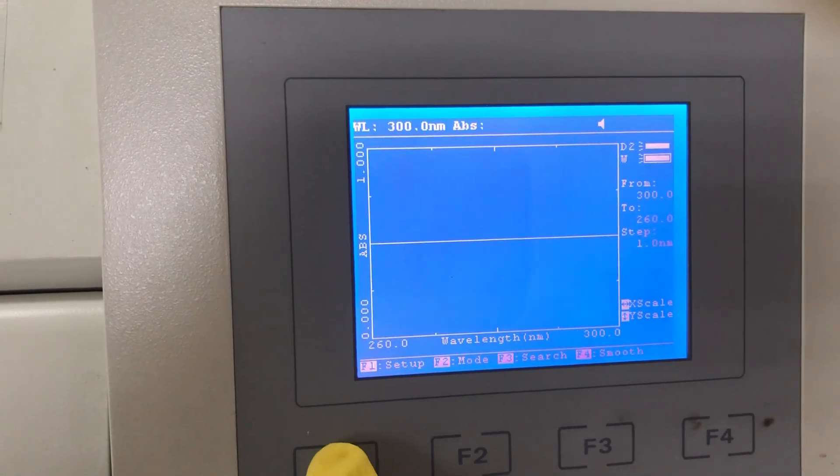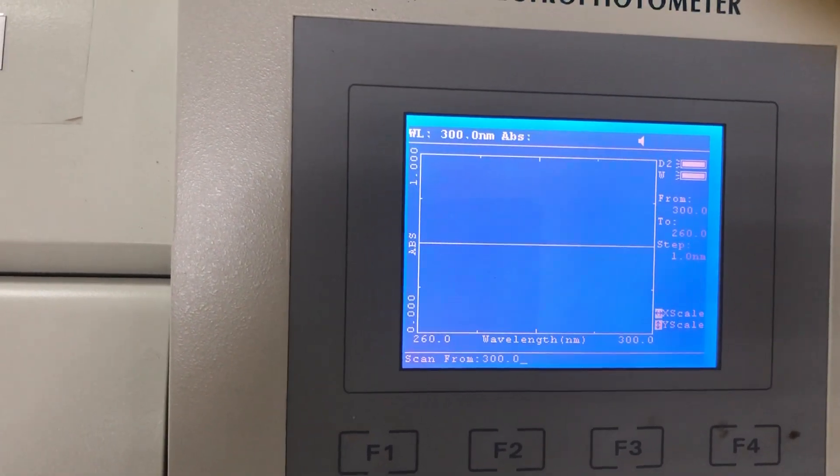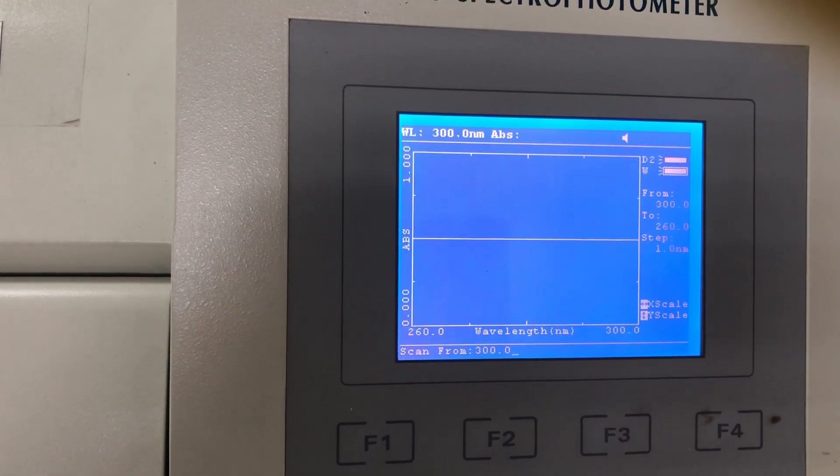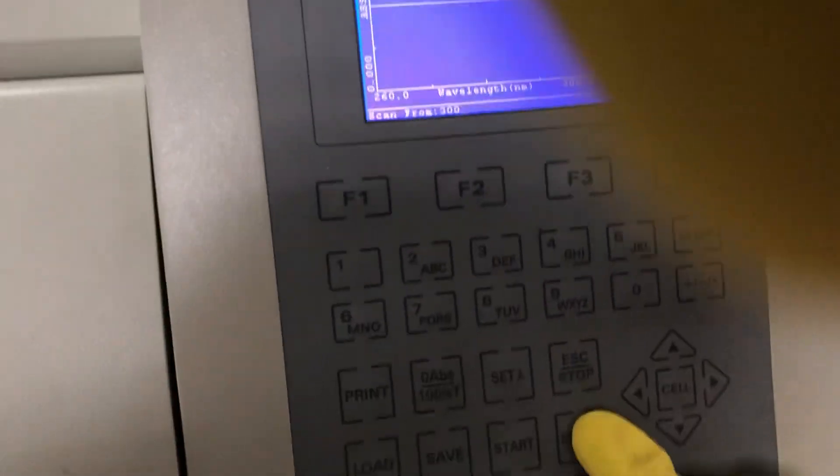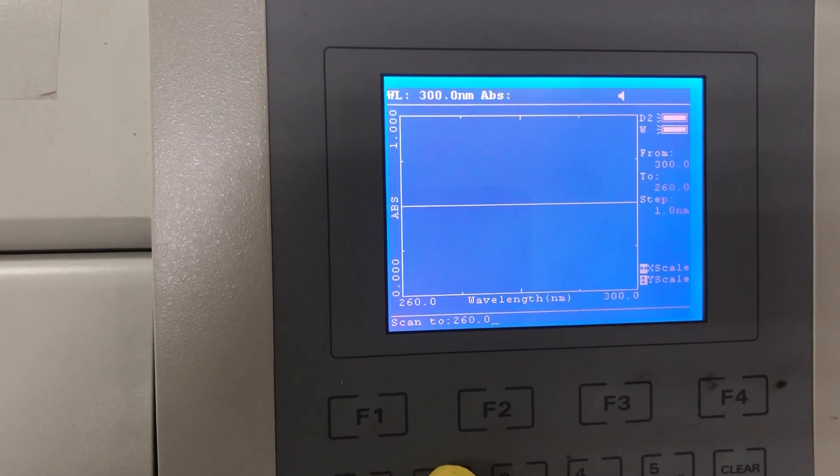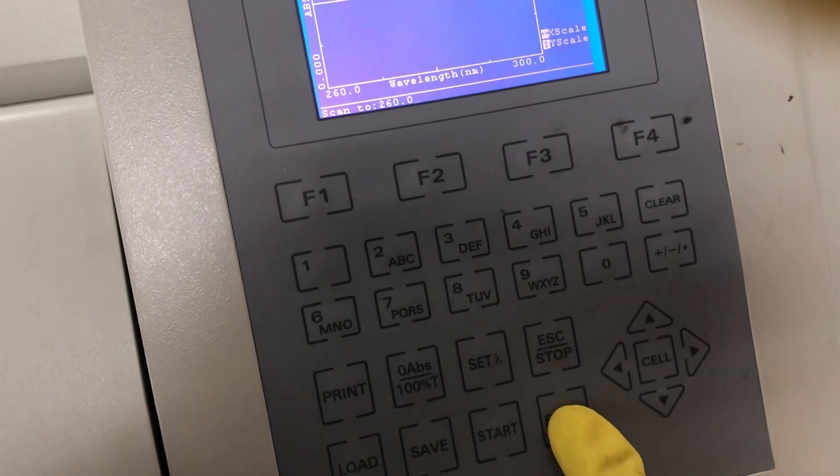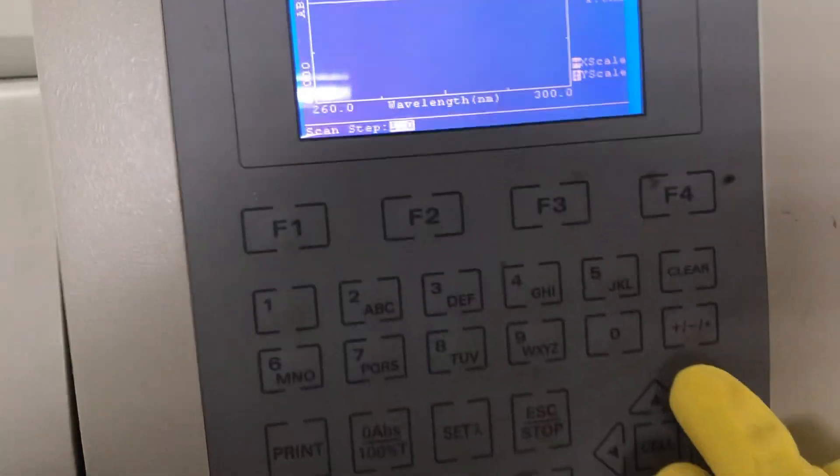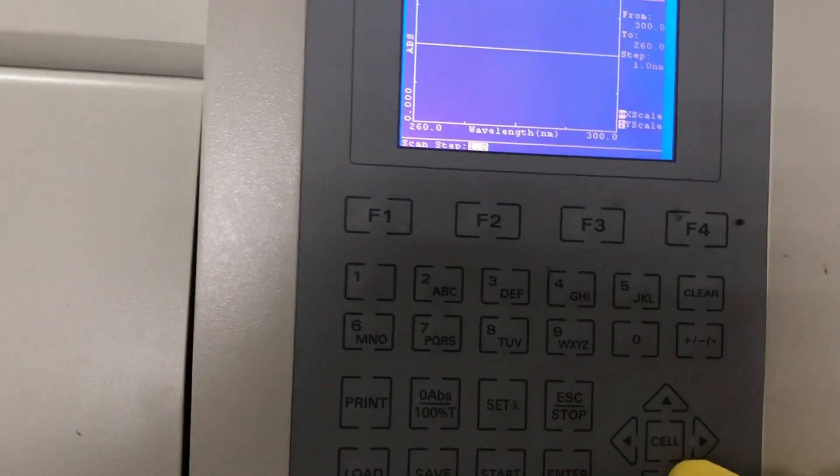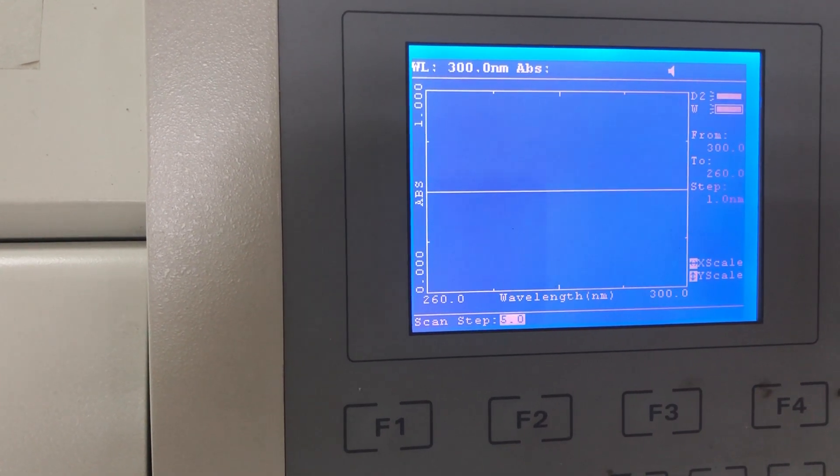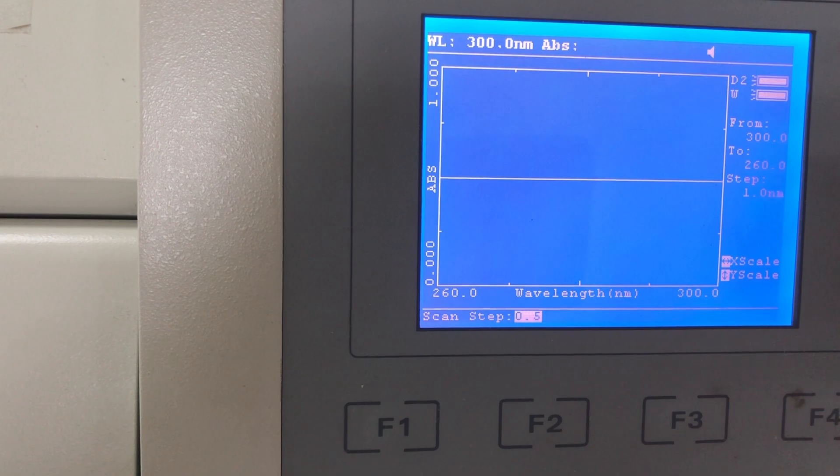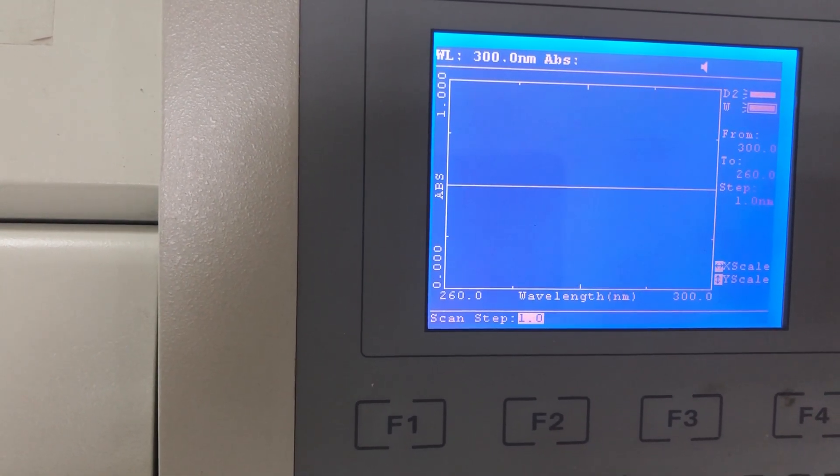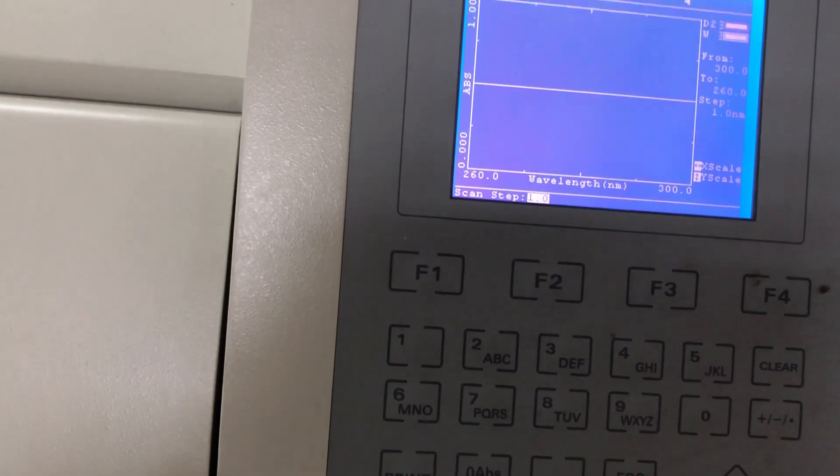For Setup, press F1 and enter the scan range from whatever you want. For me in this case, 300, then press enter. After that, the minimum wavelength is 260, then press enter. The scan step is one. You can change it from the arrows up and down. For normal scanning, press one. After that, press enter.